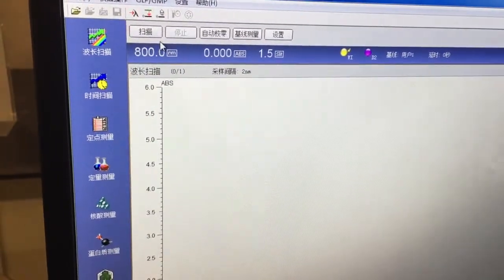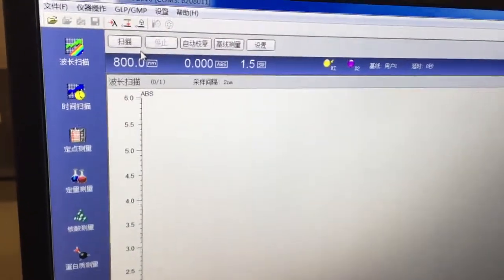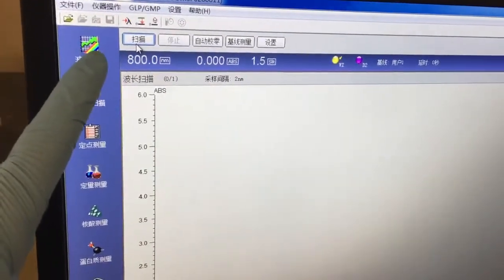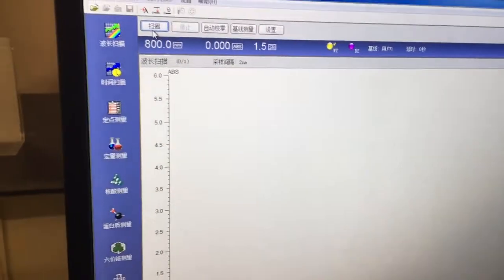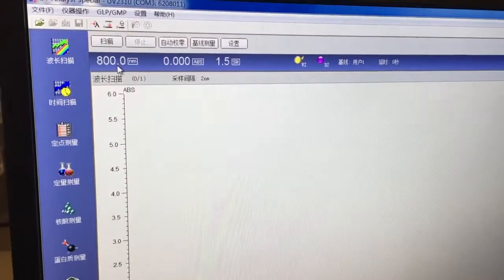After that we put our sample into the sample compartment and we keep the same baseline into the blank, and then we can press the button to measure the wavelength, right? So how will the sample data be saved? In scan. After this scan, where we have to put the name of the sample, where the data has to be saved. Yes, I think so.